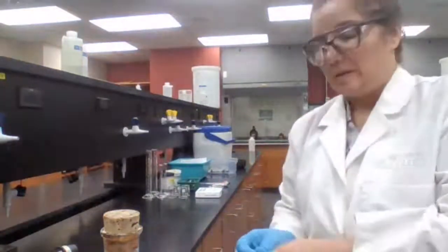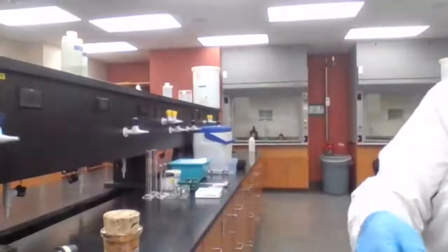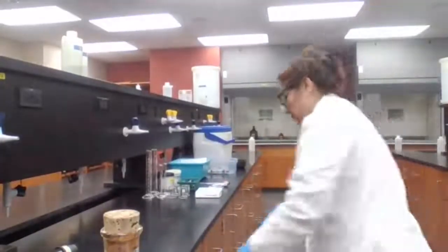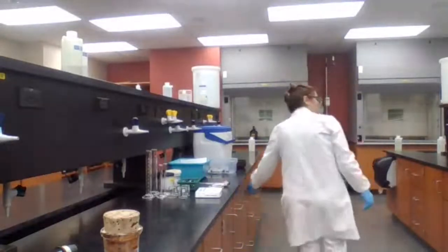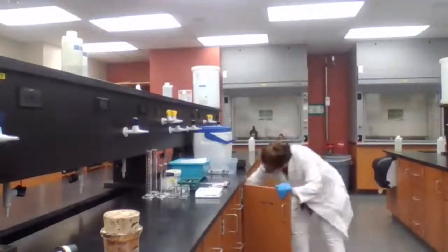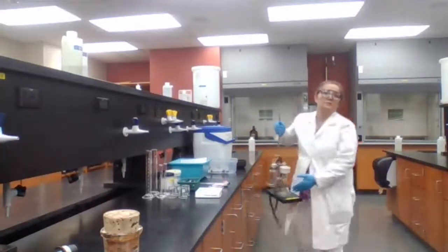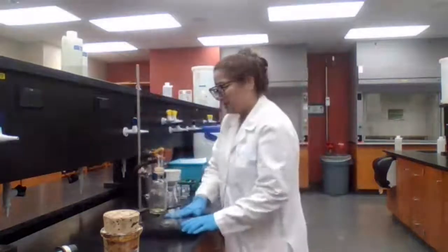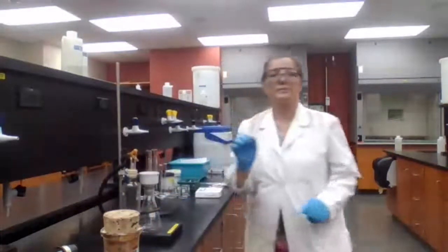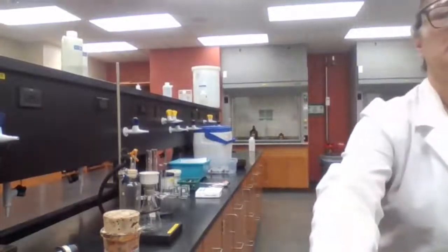Okay, so do vacuum filtration. There are 2 buckets of pieces there. Okay, that's missing pieces, I don't know.